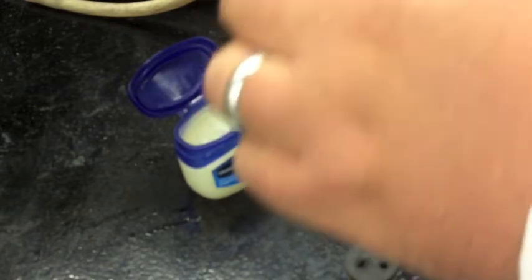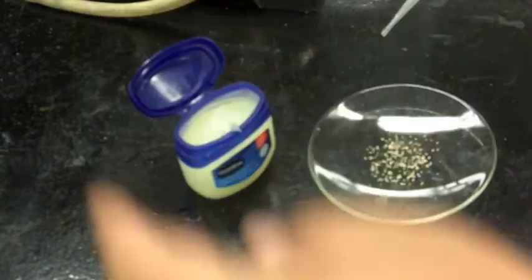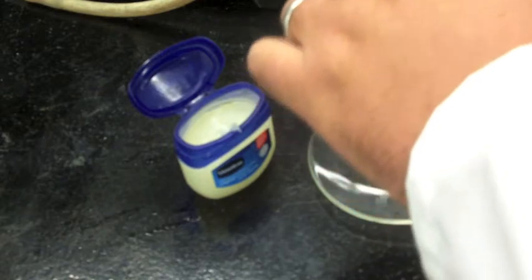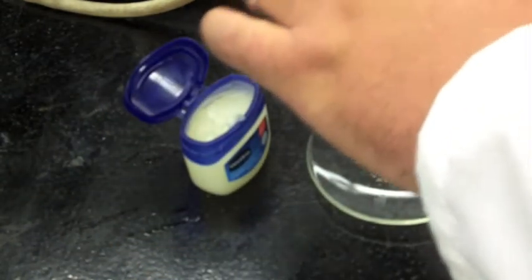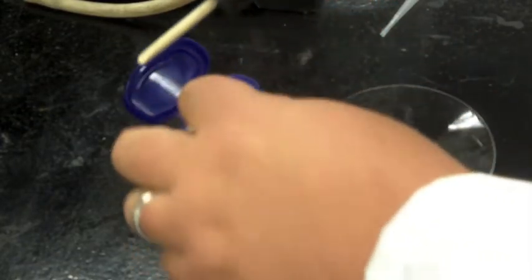That will allow the stick to slide up and down through this stopper to put the yeast into the tube. You need to first make sure that your stick can slide back and forth, and then put a little extra glop of Vaseline on the bottom. So now you can see it's sliding pretty nicely, and we're putting on a little extra glop.